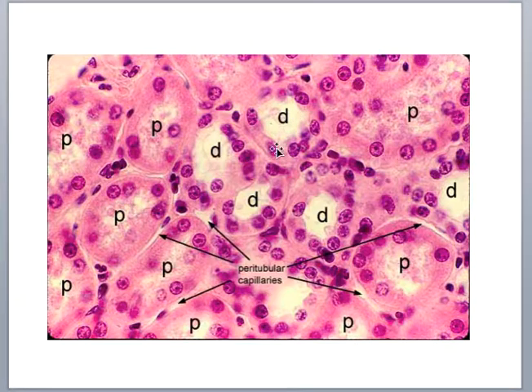If you look at these that have the D's in them, the lumen is relatively clear or clean on the inside, and that's because the distal convoluted tubules do not have microvilli, and so the bulk of tubular secretion happens in the distal. What I mean by secretion is stuff that didn't get out at filtration, but our body does want to get rid of, we'll just actively secrete it into the filtrate to eliminate it as urine. Okay, and so that takes place in the distal.